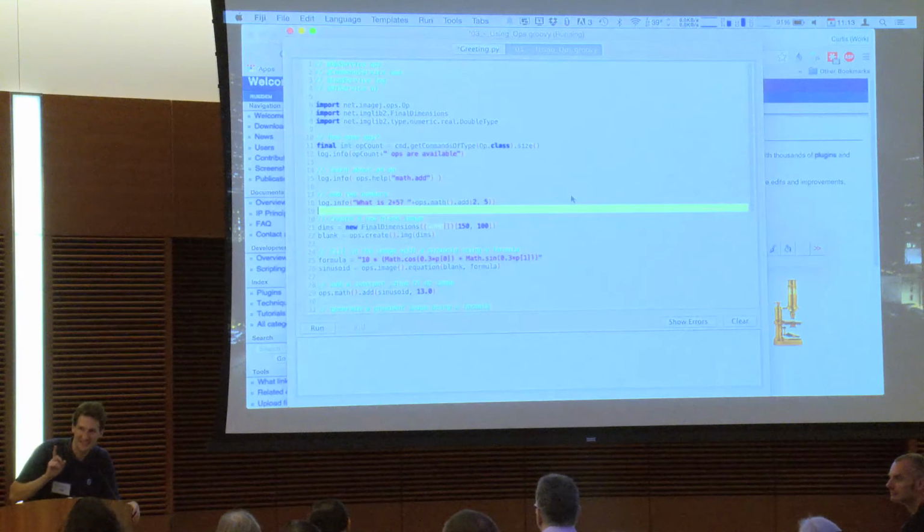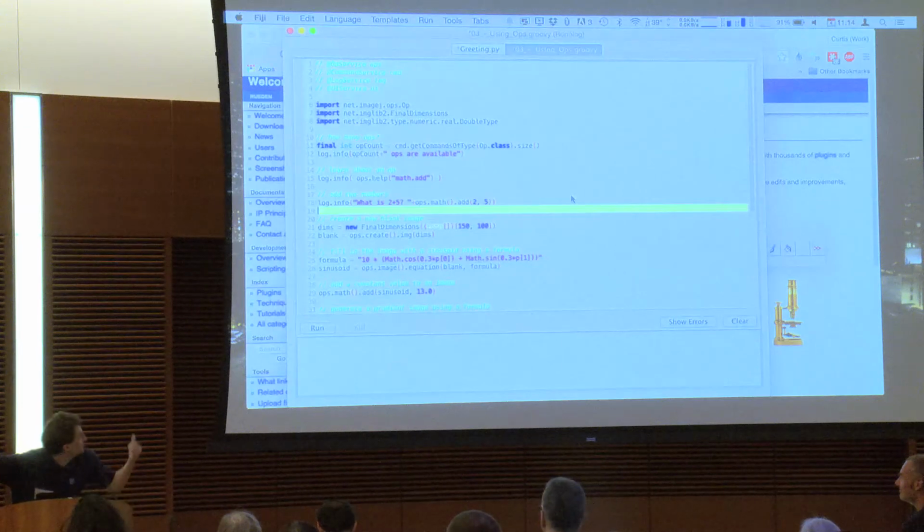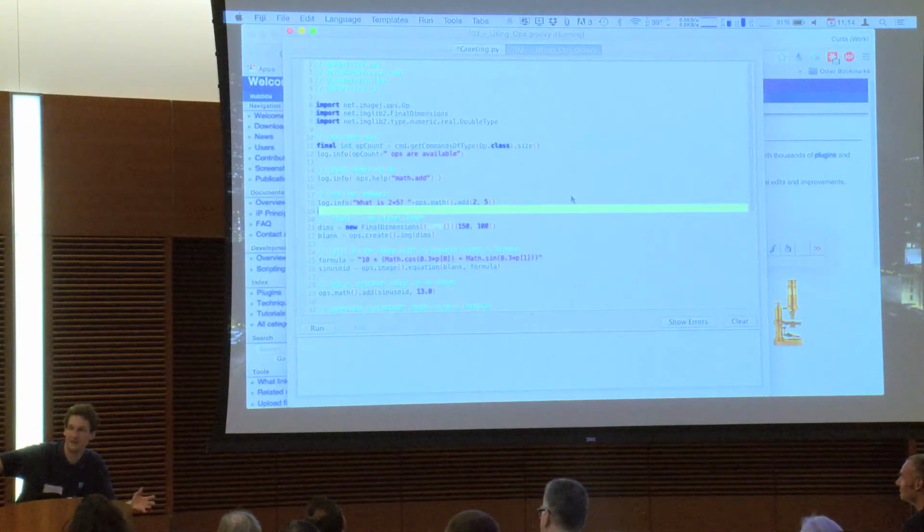Yes, so there are a couple of things. First of all, help will tell you, if you already know a command or a particular method, what all different kinds of arguments you can give to it, like basically what are all of the adding ops that are available.